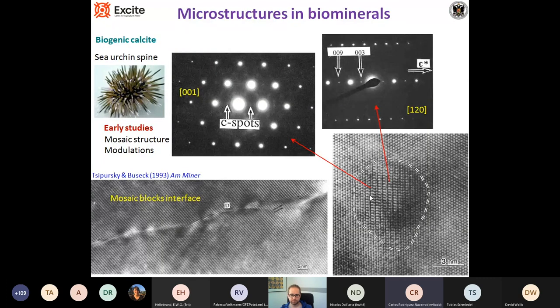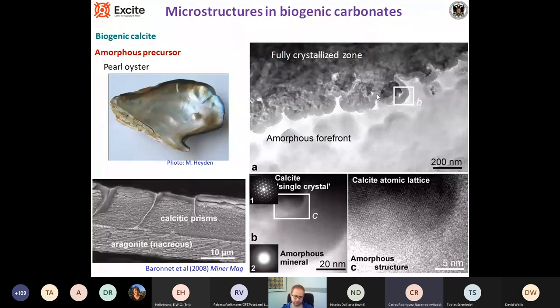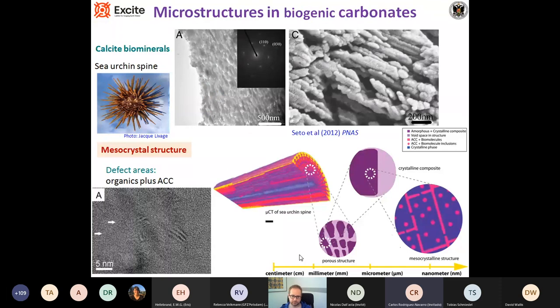In the case of biominerals, we can see superstructure, mosaic structure with different orientations in different parts of a crystal, and modulation with extra reflections. We can see non-classical crystal growth — for instance, in the pearl oyster, we see areas that are amorphous alongside crystalline parts, inferring that growth proceeds via an amorphous precursor. We can see mesocrystalline structure in the spicule of a sea urchin spine — an aggregated crystal showing different levels of hierarchical aggregation and orientation, basically a mesocrystal.